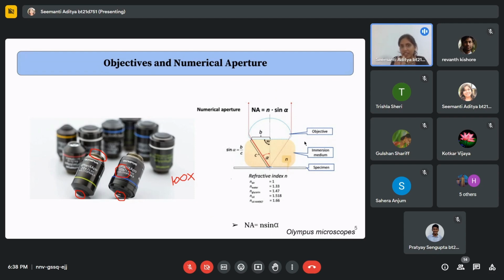There can be growth of any kind of, not bacteria, but like fungus, or some kind of spores can grow, and those are very bad, because when you are trying to image, if these are growing inside the lens, you will not be able to get a clear picture of your cells or your sample, because the lens is contaminated now. And for cleaning this part of the lens, we have to call people from the company, and they charge a hefty amount to just clean the lens, and it also takes a lot of time.